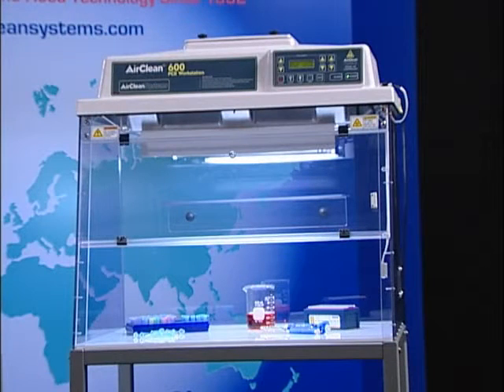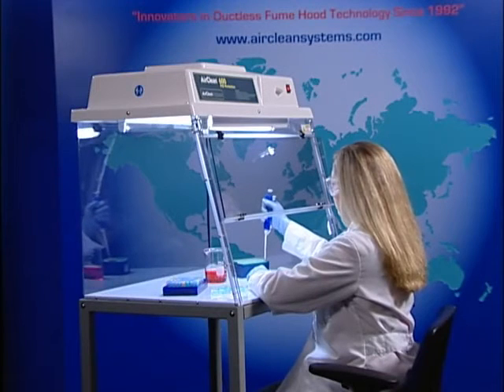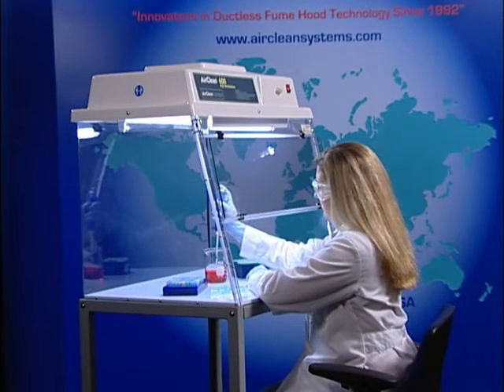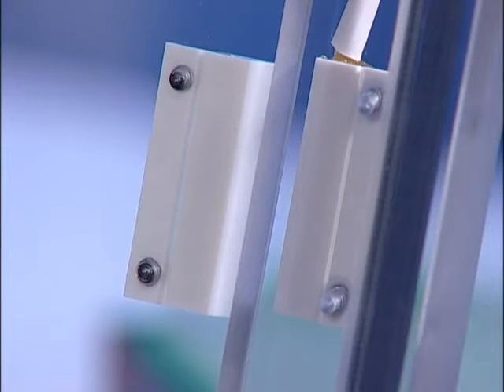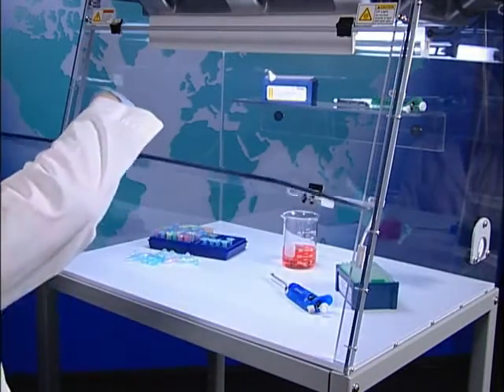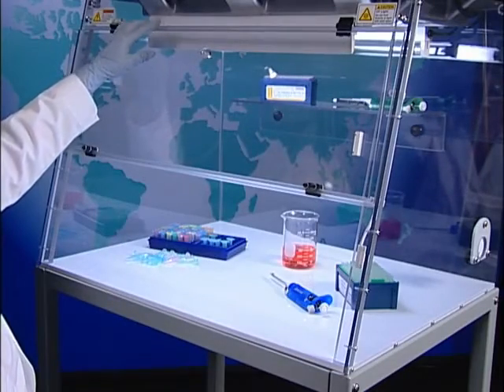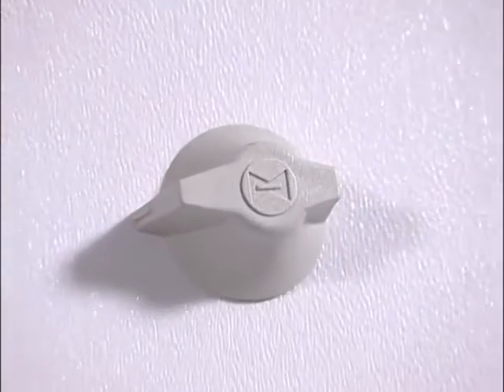The combination workstation is designed to provide a class 100 clean bench work environment and UV light sterilization. The dead air box is constructed completely from UV resistant materials. Designed with operator safety in mind, the workstation is equipped with the sash safety switch that automatically turns the UV bulb off when the lower sash is opened. When the sash is opened, the fluorescent bulb is illuminated. A mechanical 15-minute timer is standard on each dead air box.